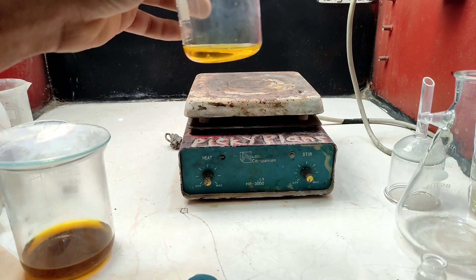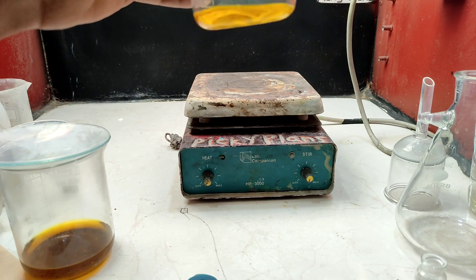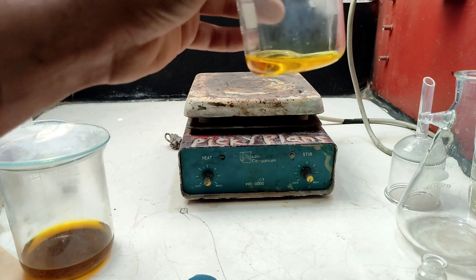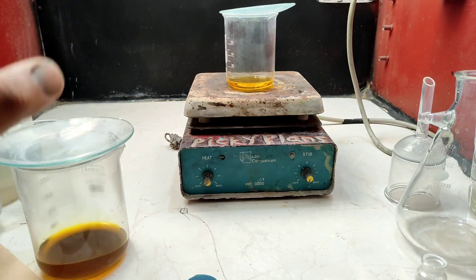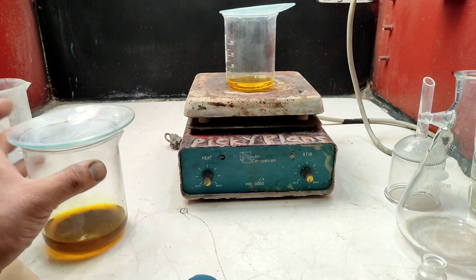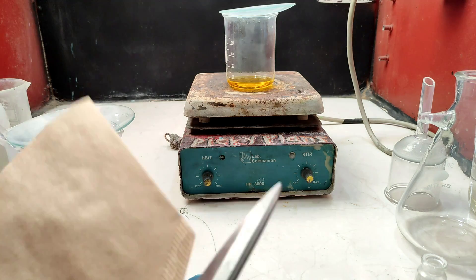I let this solution sit overnight for the two little gold beads to dissolve. Here is the clean solution with no remaining gold traces. The other one is quite impure — there are lots of impurities at the bottom that need to be filtered off.